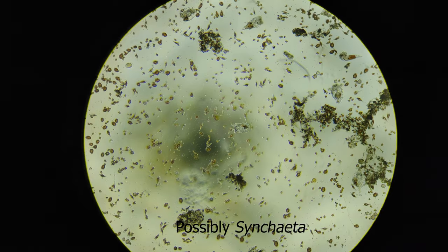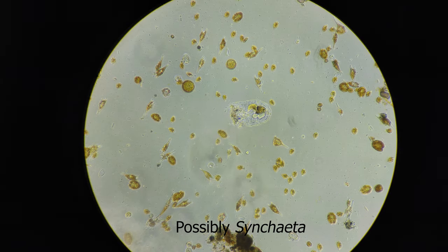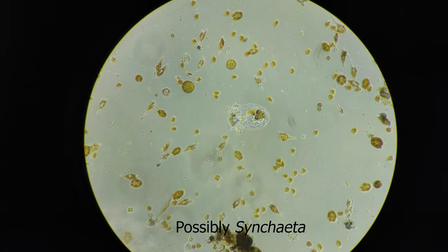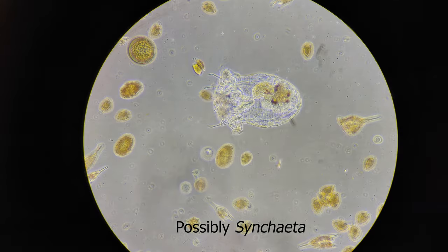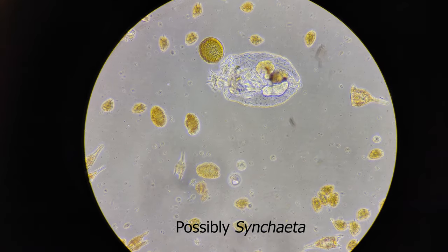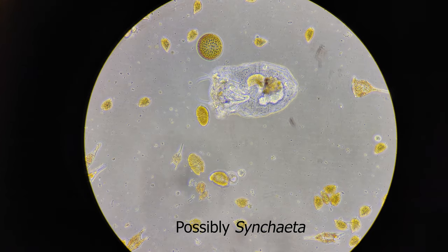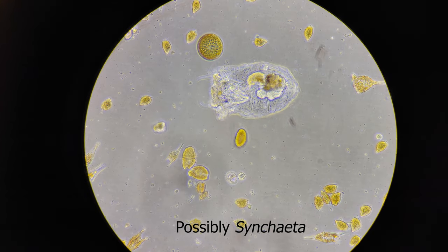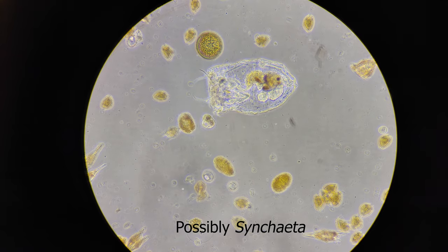I believe this is a rotifer. Rotifers are much more common in freshwater environments but marine rotifers do exist. We're able to visualize its internal structure really well even though it's largely transparent because I'm using phase contrast microscopy. Phase contrast microscopy works by converting the phase shifts of light as it passes through mediums like the transparent body of the rotifer into differences in light intensity.